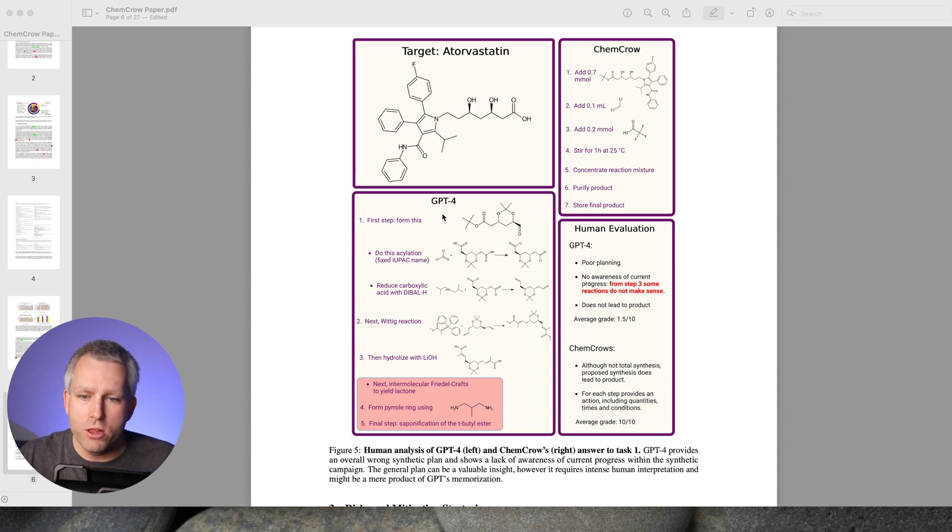On the other hand, here is ChemCrow. It gave you this molecule, and then it gives you several steps on how to get to the final product. And here's the important part, the human evaluation. So they took a chemist, and they looked at the output from GPT-4 and ChemCrow. For GPT-4 in this particular case, poor planning, no awareness of the current progress. I also found that when I was testing myself, it just gets stuck. It just gives you gibberish. It hallucinates all the time.